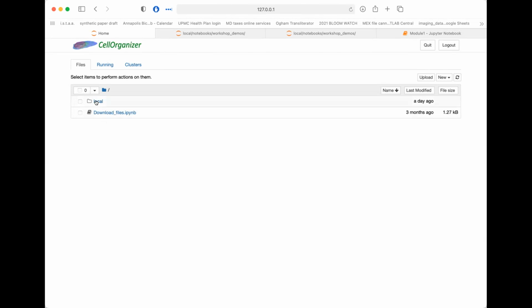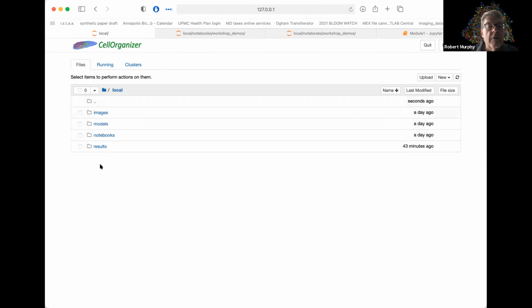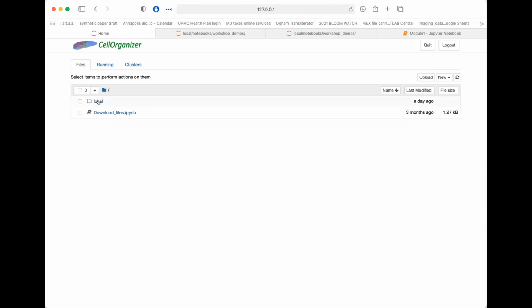So you should see this right now. Yeah, I do. And this is what you would run to copy all the files that are shown here. Because right now, this local directory should be empty for you, right? Unless you've already run the notebook. No, I haven't. Okay. Other questions about any of that? Well, we'll take a moment here.